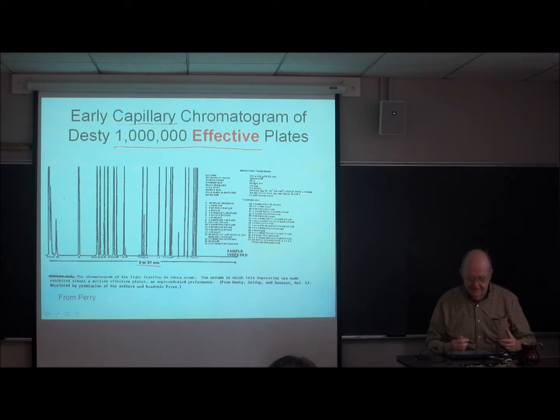He had to make his own detector. I think it was a flame ionization detector, which had recently been developed. And, you know, this is another mind-bogglingly good separation. And GC was on its way.